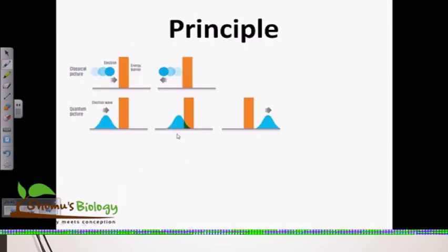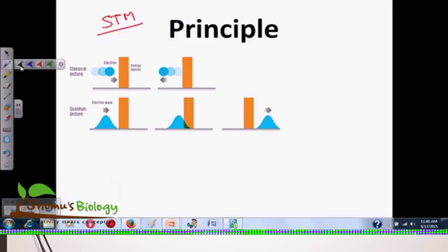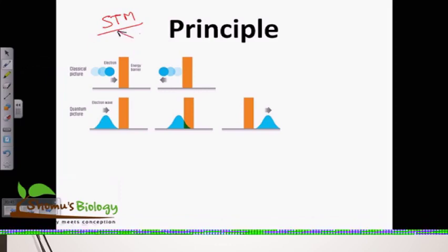So that's what we talk about in this video. This is the principle that is the core foundation of quantum tunneling microscopy or scanning tunneling microscopy. Remember, STM, scanning tunneling microscopy. Why the term tunneling here? Because of the use of the quantum tunneling effect.